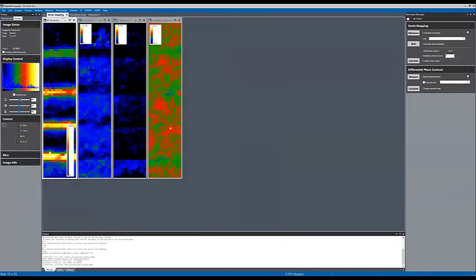While you close, I have a quick question, Hannah. So if you have two similar data sets, right? One that is unstrained and the other one is strained. Can you use them to compare, or the unstrained area has to be from the same data set?